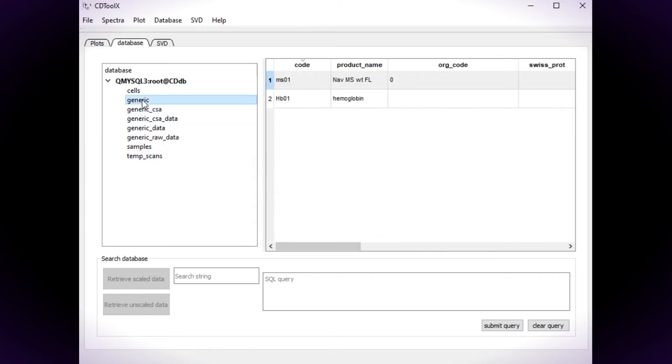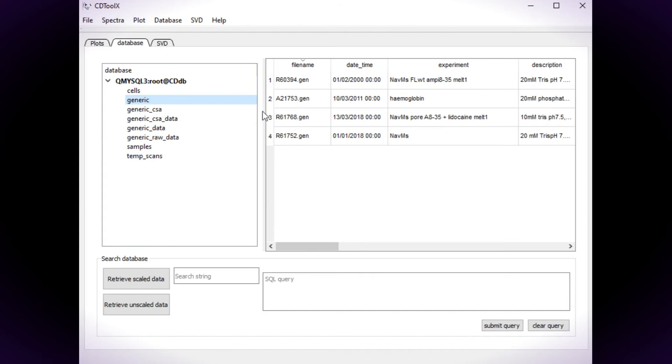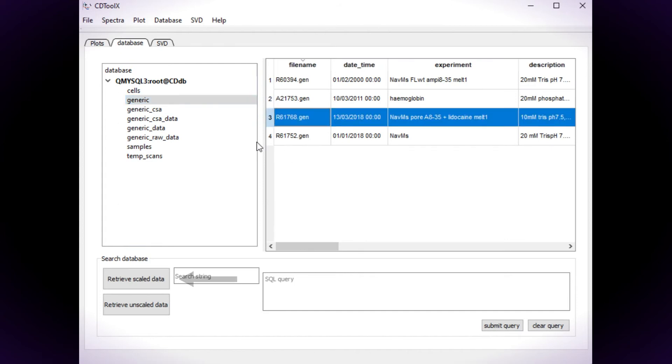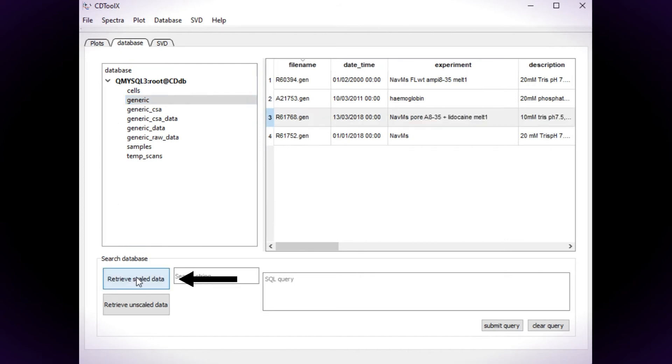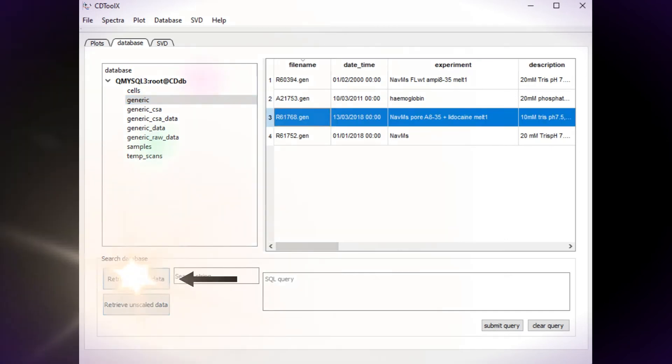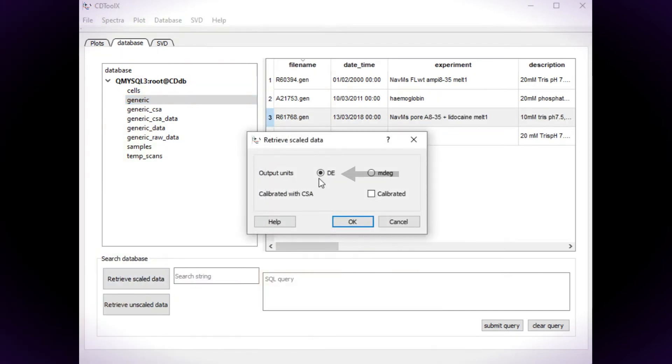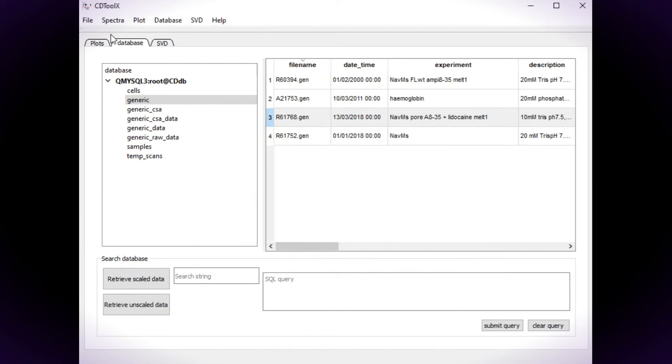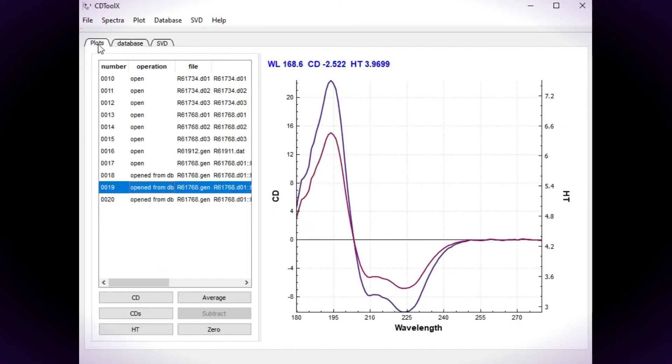Retrieve a scaled spectrum by clicking on the Retrieve Scaled Spectrum button. Then make sure delta epsilon is checked in the dialog box.